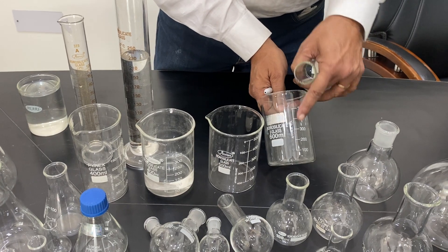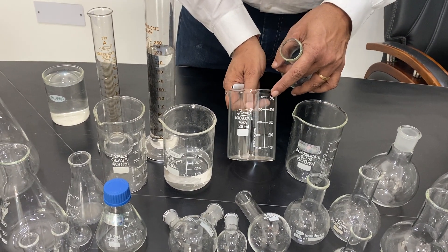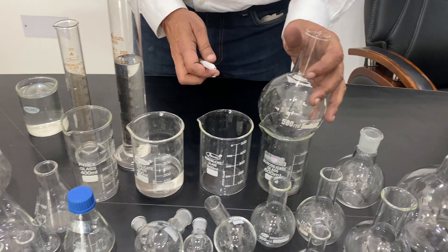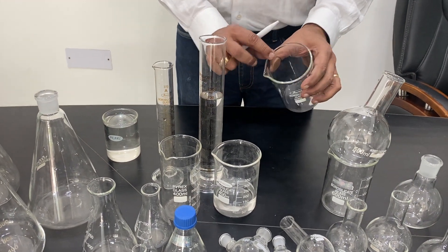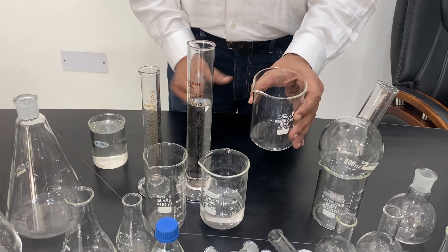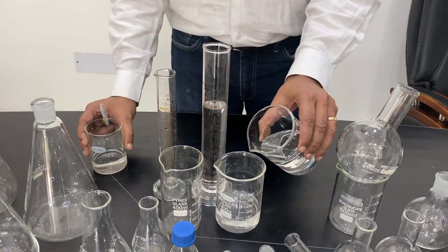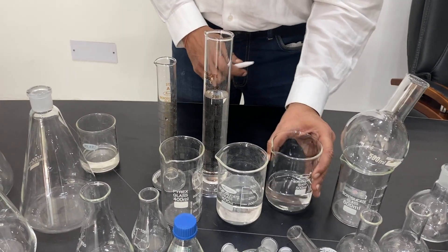Mostly the graduation is up to 500 or up to 600 ml. These are approximate beakers and beakers are only for pouring. They have a pouring lip with a rim on top and a flat bottom. You can use them for transferring chemical solutions from one beaker to another very easily.